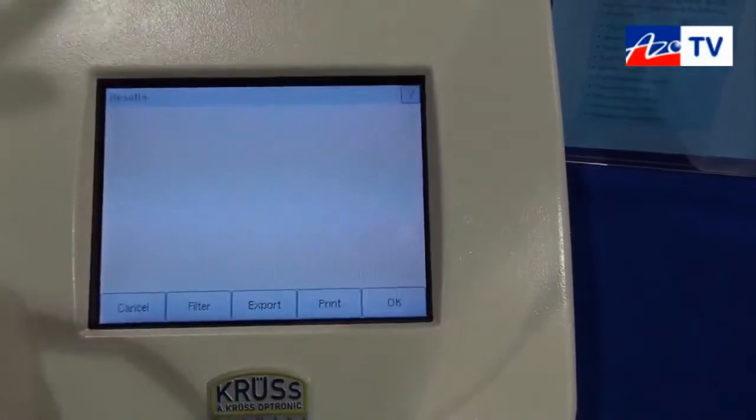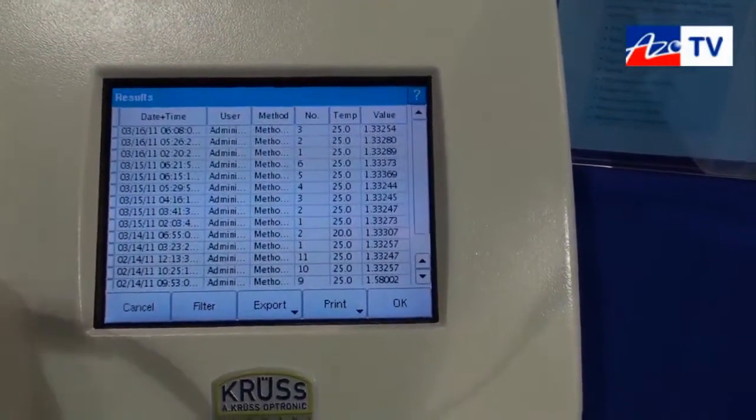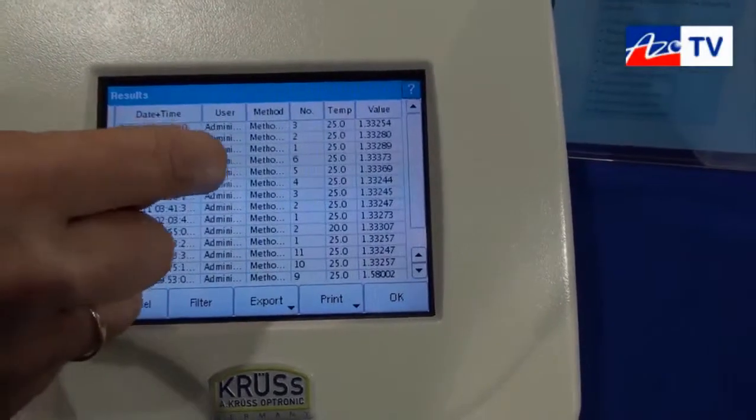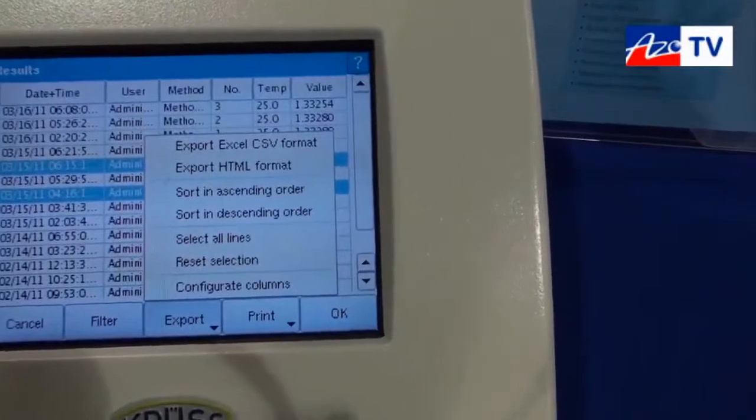We also have storage for the last 999 results. These results you can select and export as an Excel file directly to a USB stick.